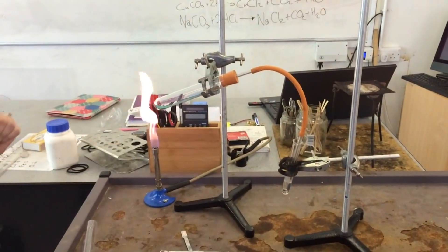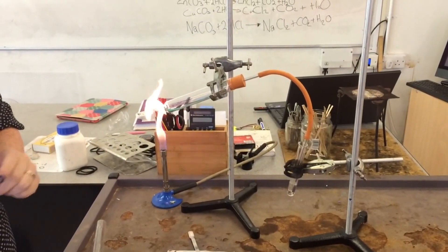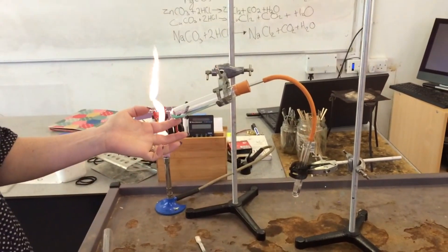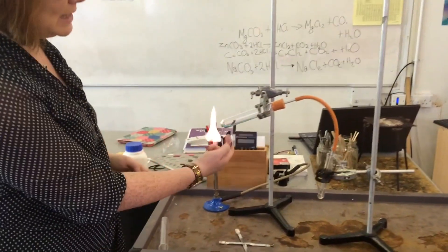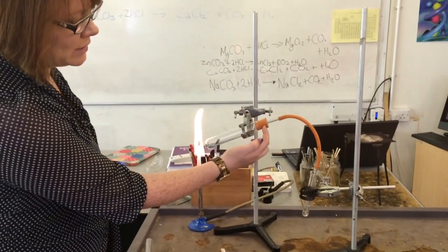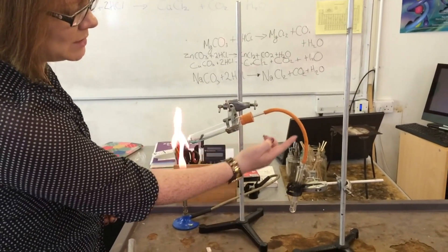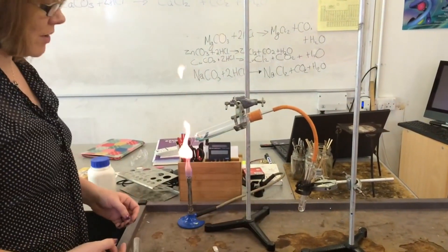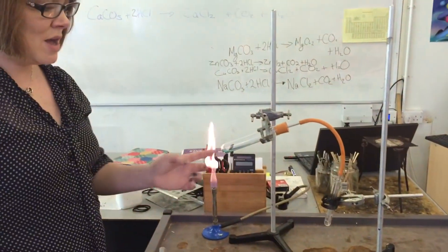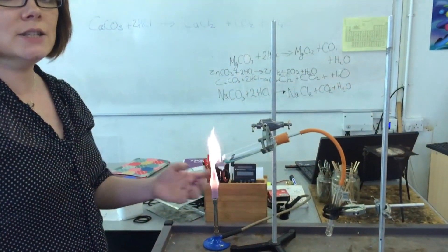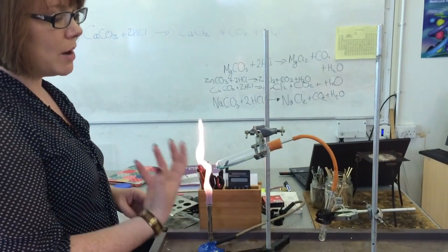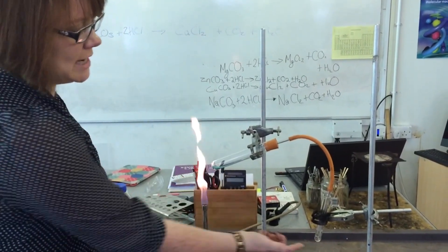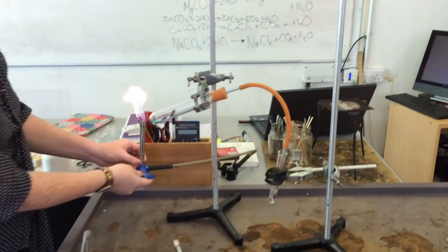Here is the setup where we're going to be looking at the thermal decomposition of metal carbonates. In here I have some copper carbonate in a boiling tube, clicked into a delivery tube, and the end of the delivery tube is going into some lime water. I'm going to heat this quite strongly — I want you to be looking for the colour change in the tube and the colour change in the lime water.